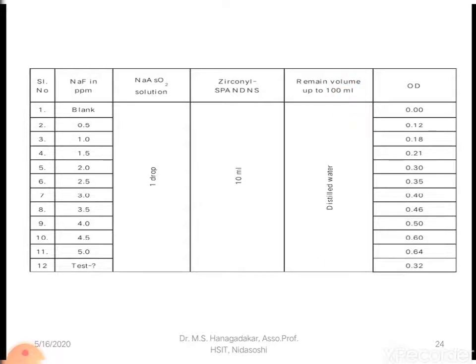Then afterwards, by using the colorimeter or spectrophotometer, we have to measure the absorbance or optical density of the solution by using the filter, that is called 472 nanometer. Sorry, it is 574 nanometer.